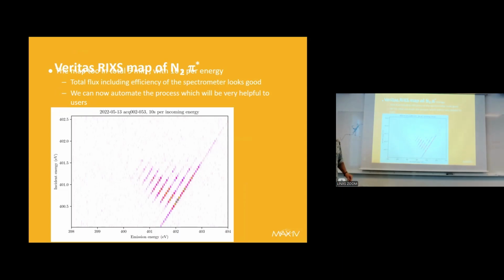So this is another tool, and this is where I mean that you could potentially also use it as measuring X-ray absorption, because you can pick and choose: either you follow a fixed emission line, or you can follow one of the vibrations to see how that develops, and you can produce absorption for all of these exotic features if you want to. So you can cut and slice your data any way you want. It's important to be able to produce these data and analyze them backwards.